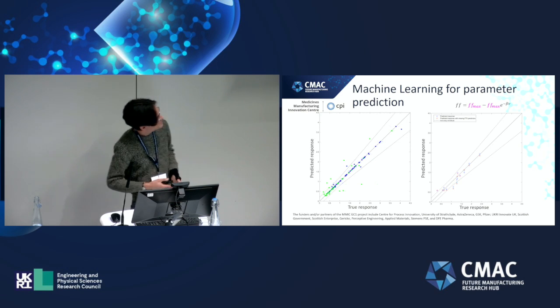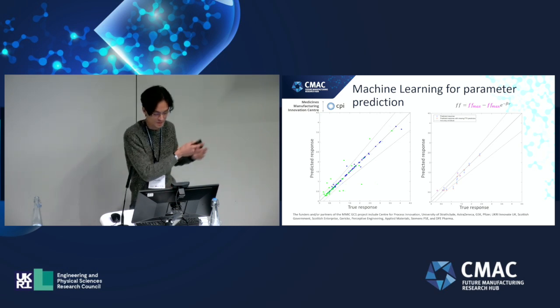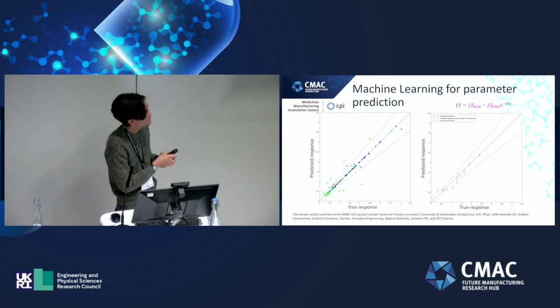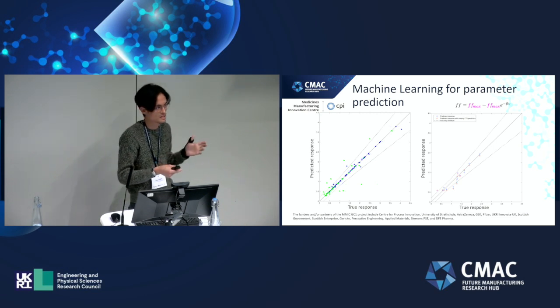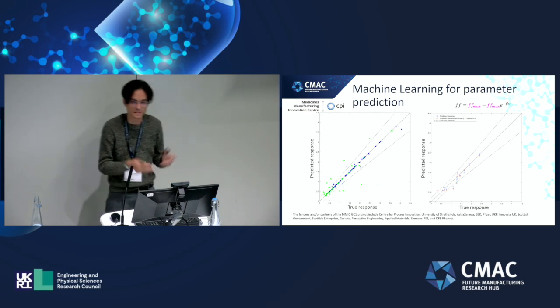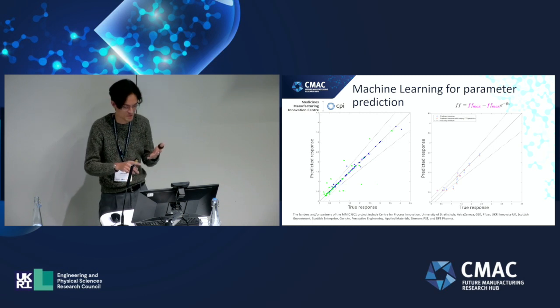Now on the right, as I said, testing data points for various APIs and excipients. Most of them do fall within the accuracy thresholds, so that's good. You can see some red and blue data points here. The difference here is that I wanted to see what the impact would be if I'm missing some of my inputs. Now, in an ideal world, you would have access to all the data that you need. You can measure everything that you want to measure. You have access to all the kit you need for your measurements.